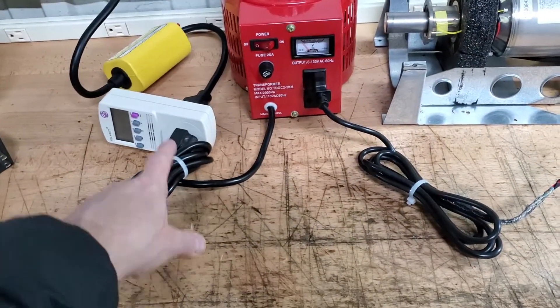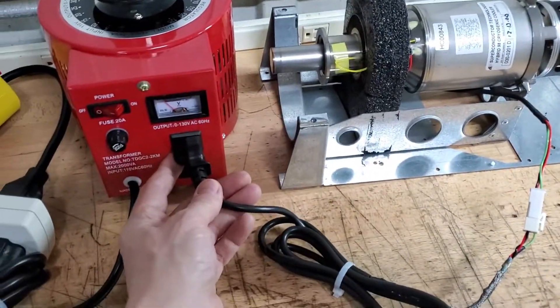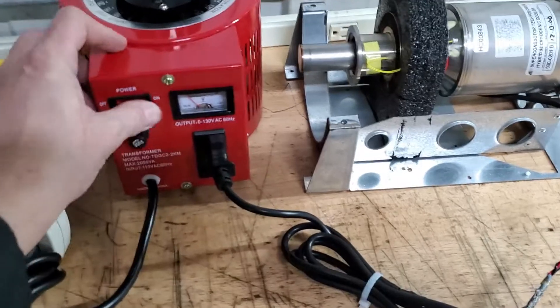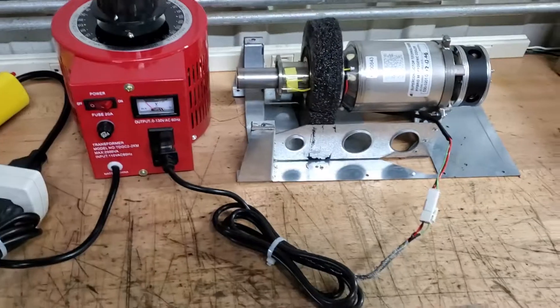Hook your variac into your wattage meter and then run the cryocooler wire to here. Then you'll power it up, slowly turning it up over a ten minute period to the desired 70 watts.